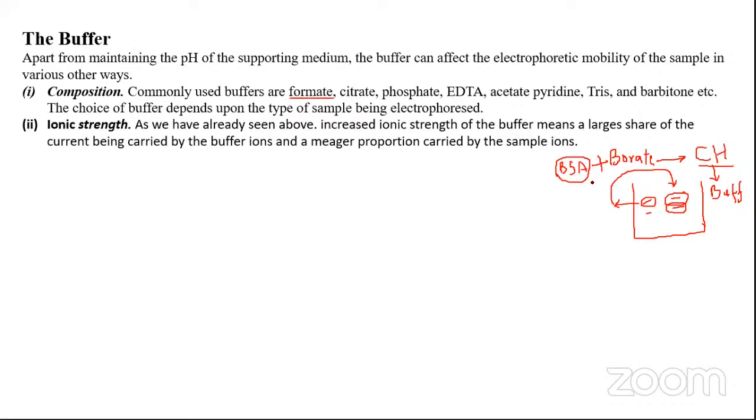Okay, then it makes sense that BSA and borate came together in some interaction, and a modified BSA was formed with the native BSA. Also, because borate, or boric acid, in itself doesn't release H plus ions, but takes them from the water and takes up the OH.